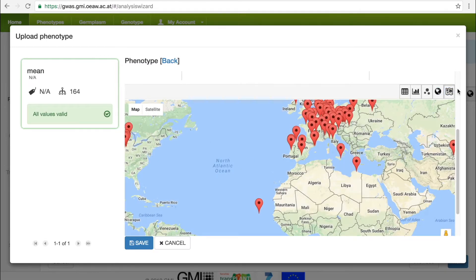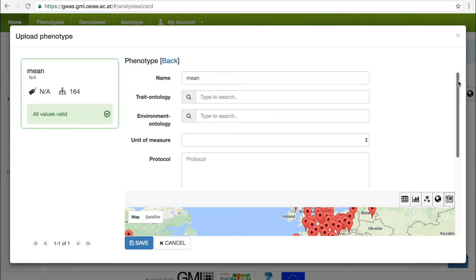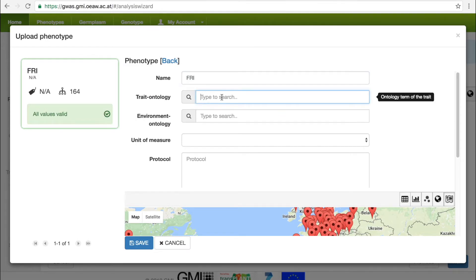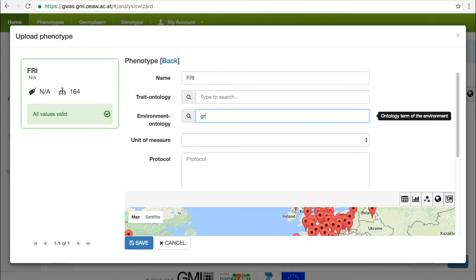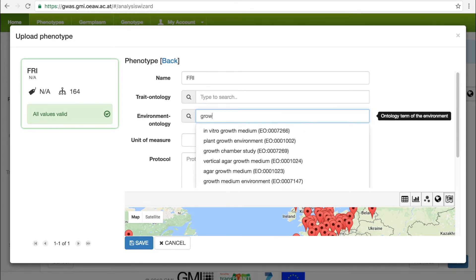Once the user is satisfied with the data, they specify a descriptive name for the phenotype, and optionally assign traits and environmental ontologies to properly tag the data. Once the user saves the phenotype, the data is stored on the GWAS Portal.